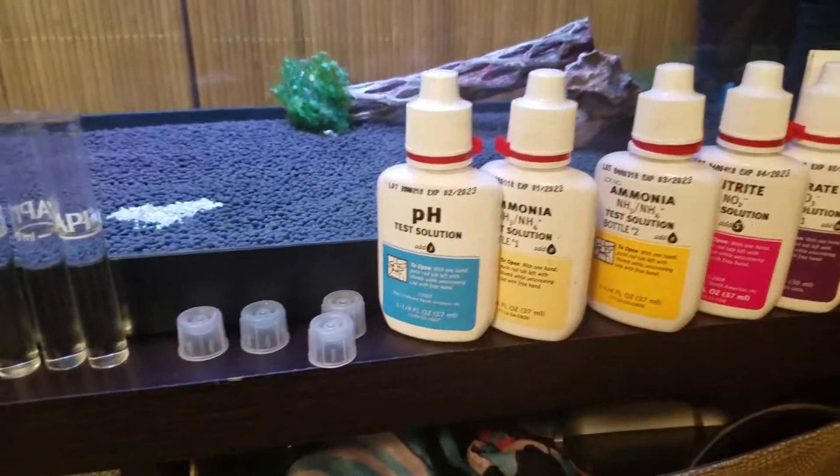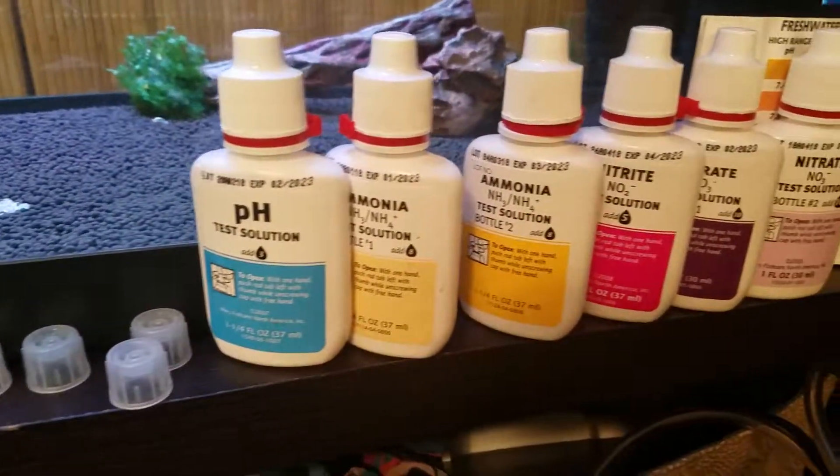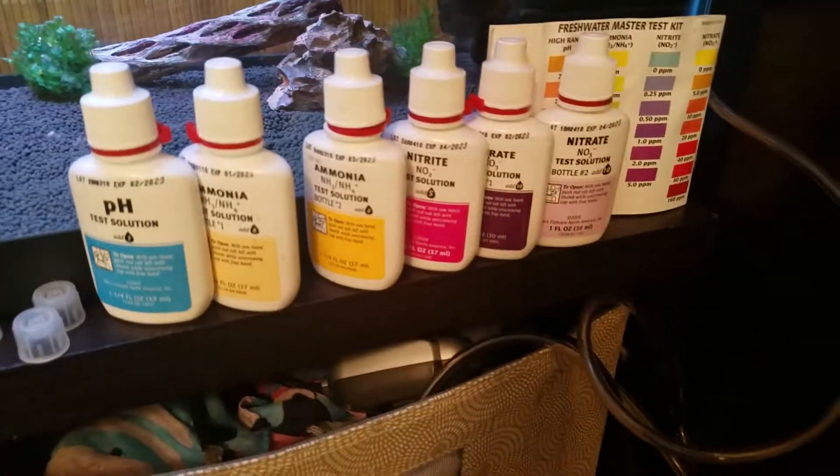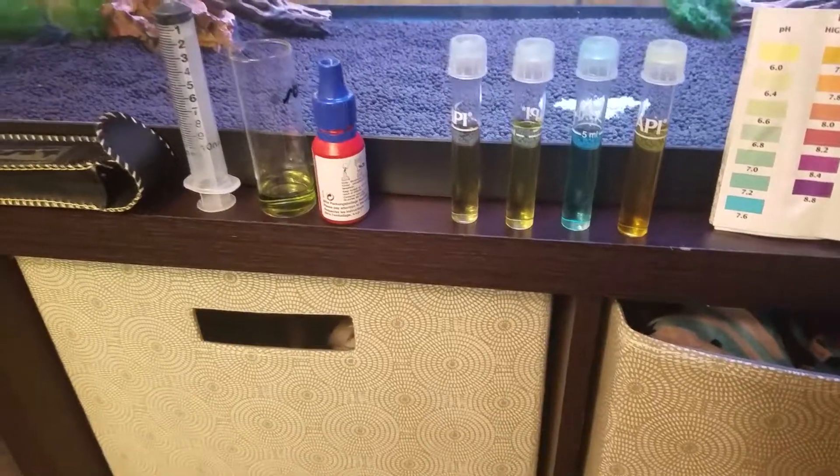Now we're going to follow the actual instructions for each of the API master kit tests — three drops and so forth. I'll be right back. Alright, we're back — I've added all the drops.